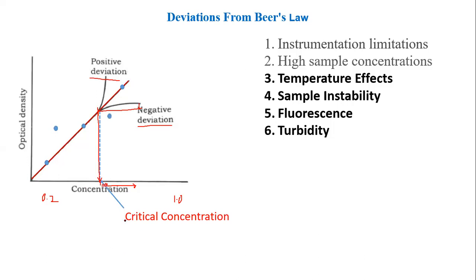No, ideally, see, this is actually a very good question. What happens sometimes, as I have shown over here, although I have shown this as a critical concentration, when you actually plot the standard curve, you don't get all the 5 points on the line, right? How many of you get all the 5 points on the line? No, you don't get it, maximum 2 to 3. Sometimes it's maybe only 2.